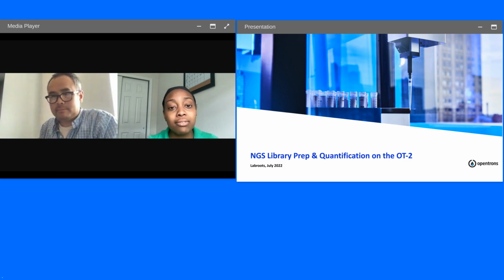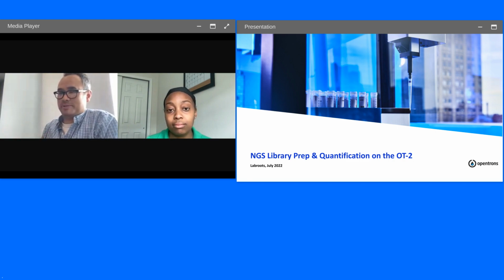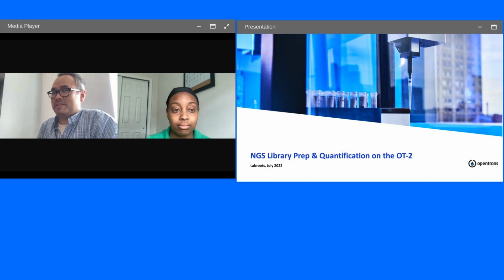A question about dead volume. How do you overcome some of the dead volume with these very sensitive library prep workflows? The way I've done it is, if I can get away with everything being pre-aliquoted into a strip tube, I would do it that way. When I do it that way, I check. Sometimes they sell the protocol kits in 24 samples, so I would measure how much they provide, and therefore how much extra dead space they allow.